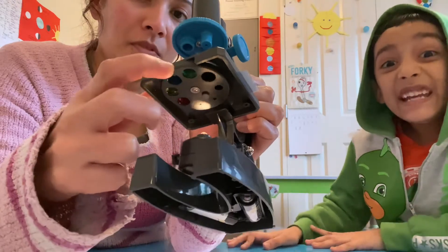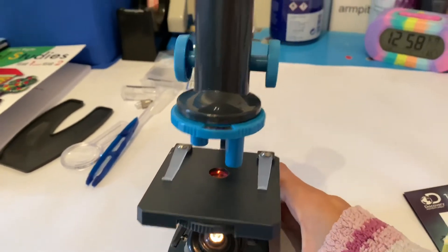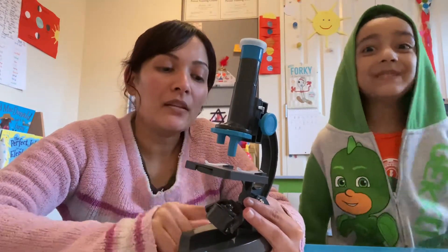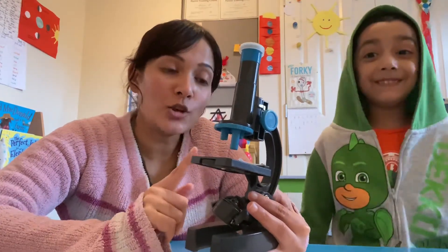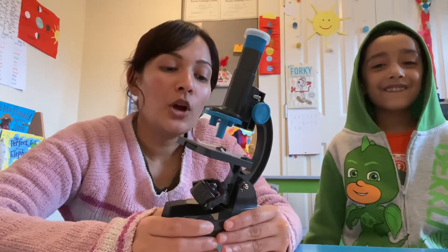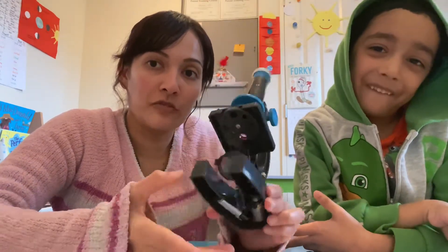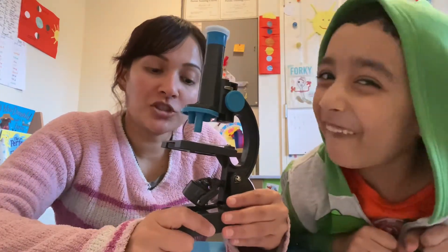It's very lightweight and pretty easy to use at home. The most important part of the microscope are its lenses — handle them with care because they can become dirty or dusty. Never clean them with your fingers or tissue paper; always use a soft cotton cloth. The kit did not come with one so you'll need to get your own. If you're not going to use your microscope for a week or more, make sure you remove the batteries.